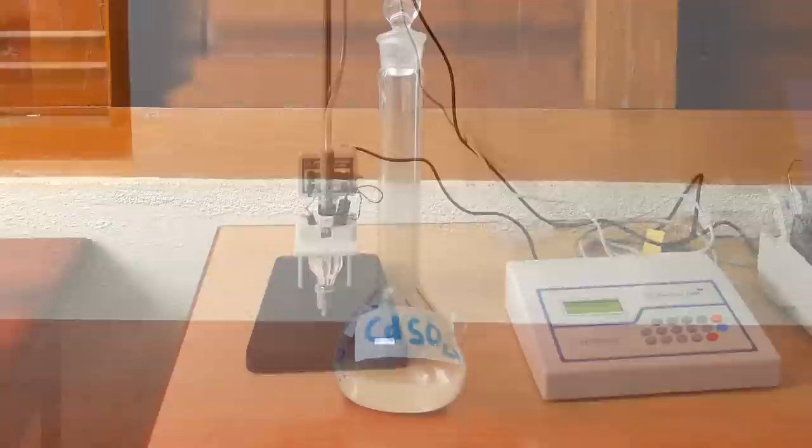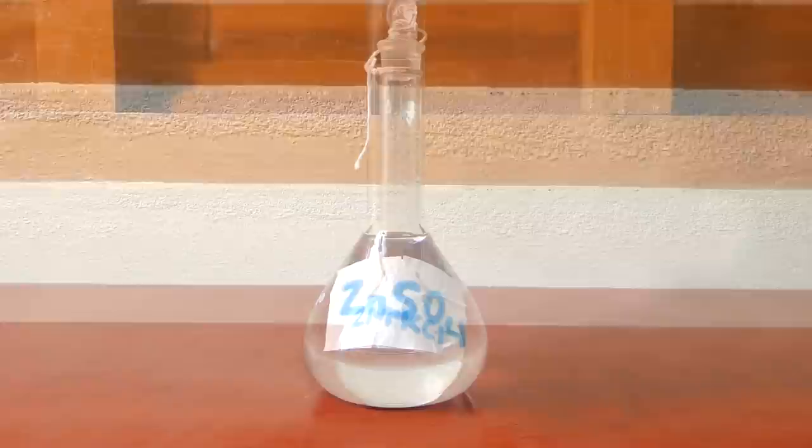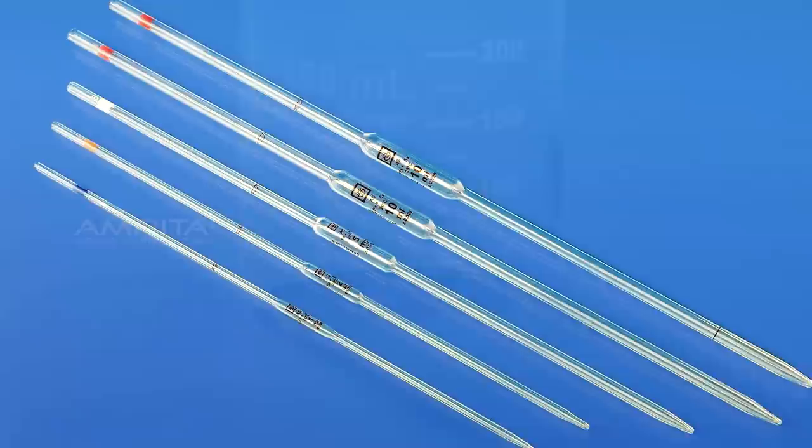Apparatus: Polarography equipment, standard solution of 1 mmol cadmium sulfate, 1 mmol zinc sulfate and 2 mol potassium chloride, distilled water, 250 ml beakers, 10 ml pipette, measuring jar.